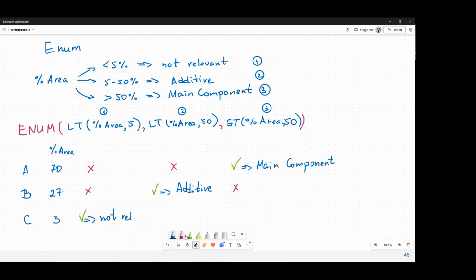And you may notice that it is also less than 50 actually. But since the first yes is reported, there will be nothing here. So this will not be written. So nothing will be given here. Although it actually has 2 yes, but always the first yes is reported.